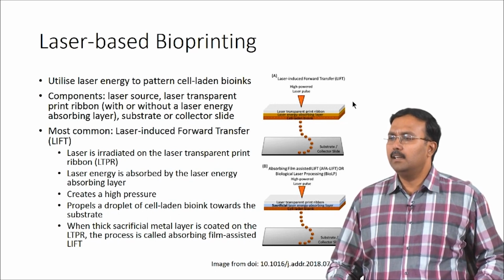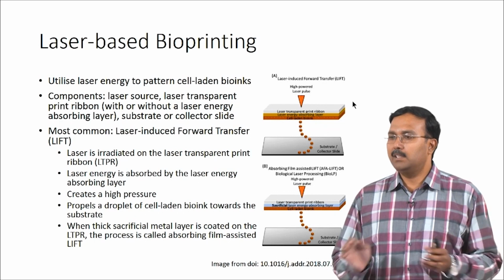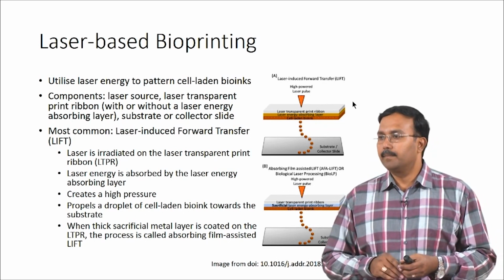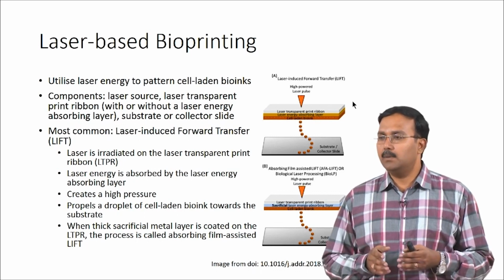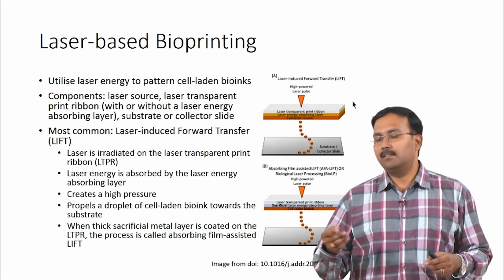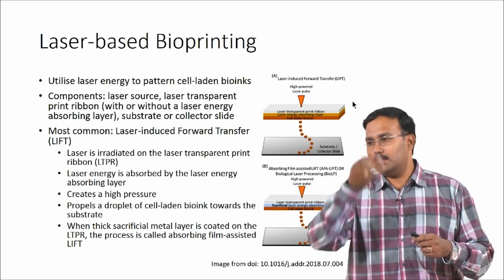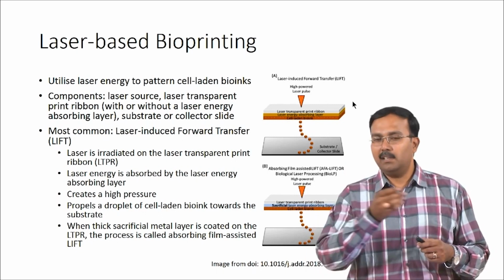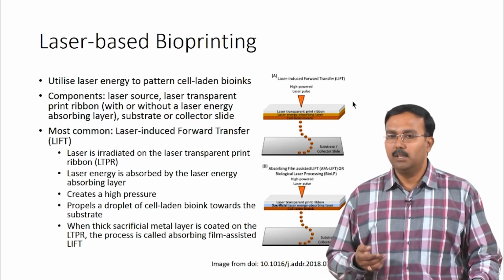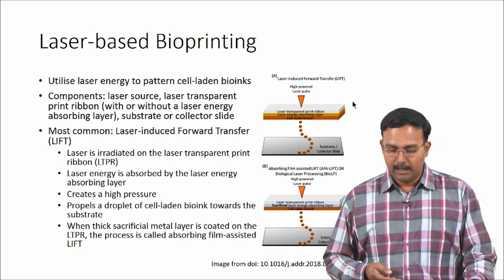And then again, it is a highly viscous fluid which is loaded on the surface of this ribbon. So, it is a highly viscous liquid, so it is not just going to flow freely. If you think of something like honey, pure honey, it's not going to just fall off quickly. It's going to be there, depending on the processing time. If you have something which is even more viscous than that, it will work this way. So, it depends on the viscosity of the material.